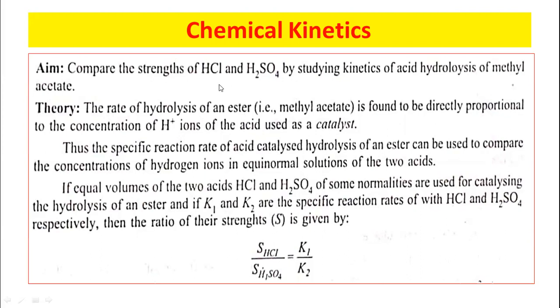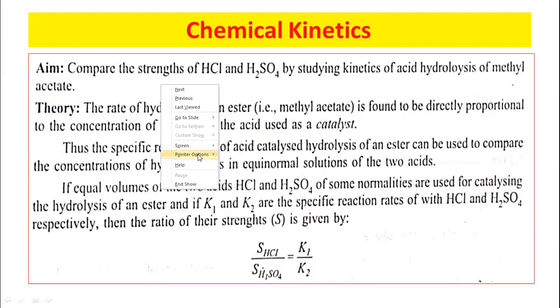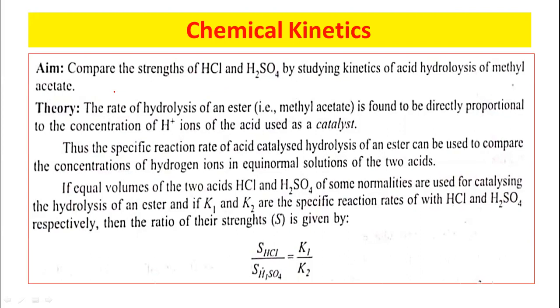So we have to perform the acid hydrolysis of methyl acetate. Acid hydrolysis means hydrolysis of methyl acetate by using acid as a catalyst. So let us show the reaction here.